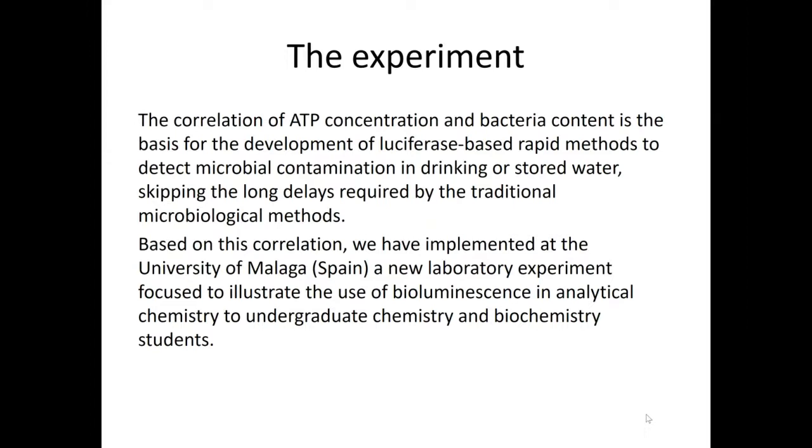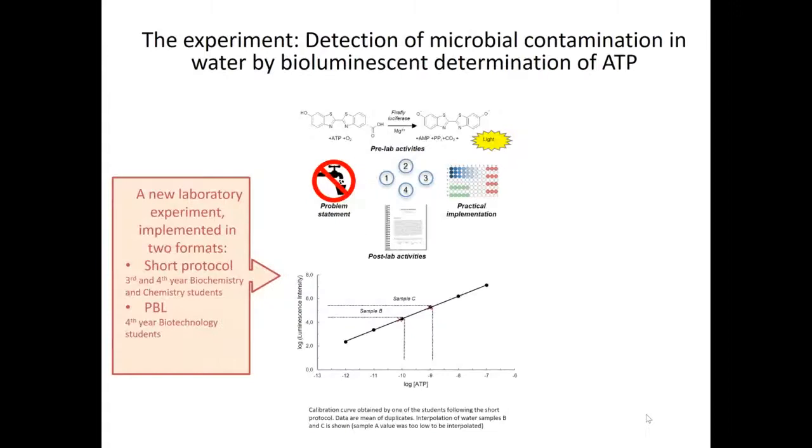Based on this correlation, we have implemented a new laboratory experiment in two formats, either a short protocol or a complete problem-based learning experience. In both cases, the driving question was the same: let's detect if this water sample has a microbial contamination or not. And it relied on the detection of ATP concentration in those samples of water.